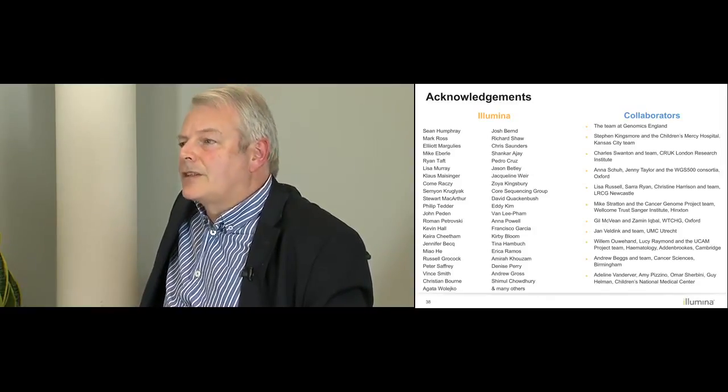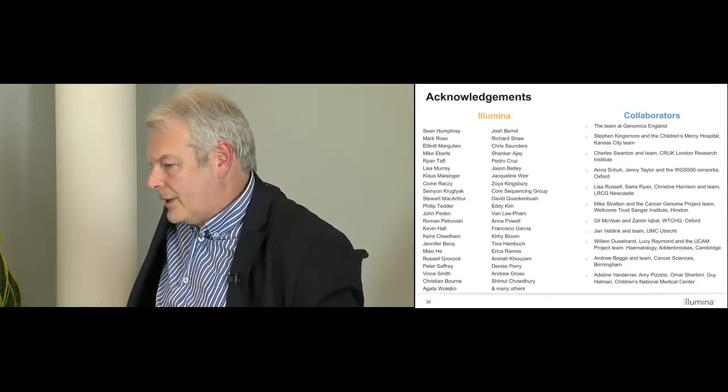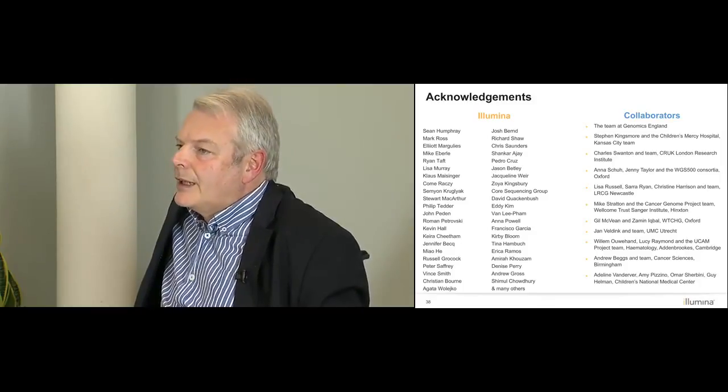The other areas, of course, are outside the central core, the sequencing engine. And these are areas where we work very much with our collaborators to examine it. The ability, as I've already mentioned, to collect sufficient good quality DNA to start the process off. So we've had to completely re-examine how the formalin fixation process is done. It's been done that way for 100 years or more, but we need to change it now because there's a new demand for it. Or do we move away from FFPE? These are big, fundamental, essentially roadblocks to the process because you do want every cancer patient to benefit. At least you want every cancer patient not to be excluded simply because their sample wasn't good enough. You at least want it to be a choice that it is not the best test to apply to that patient instead.